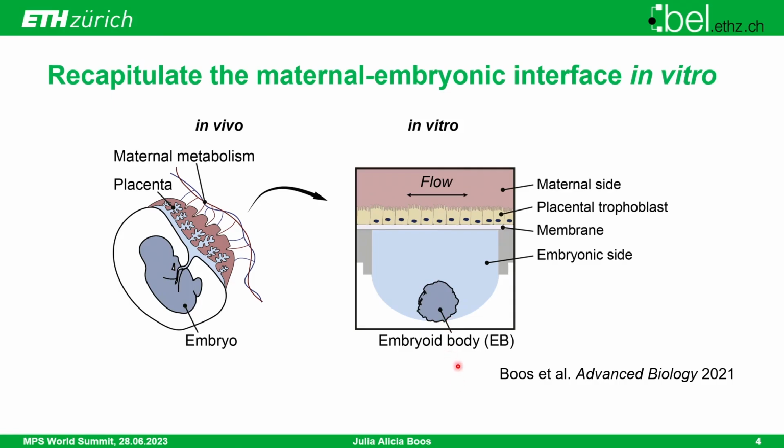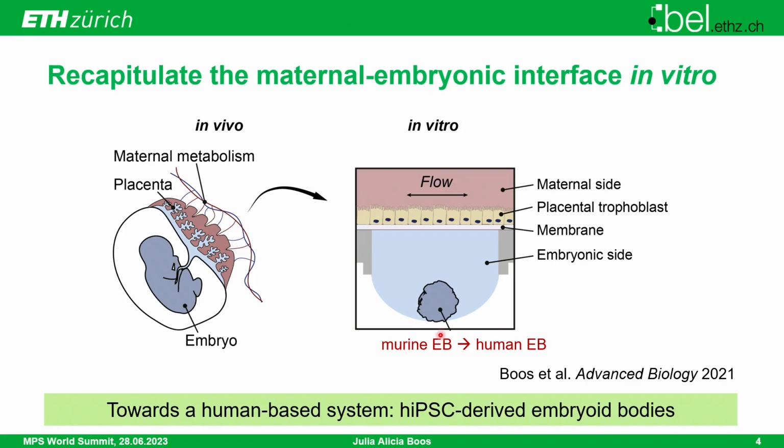In a proof of concept study that we published in 2021, we, however, formed the EBs from mouse embryonic stem cells, and now we optimized and revised also the entire system to increase its physiological relevance and move towards a human iPSC-derived embryoid body model that we now want to use in that platform. And in the following talk, I would like to focus on this new platform that we developed and towards the integration of this human-based embryo model.